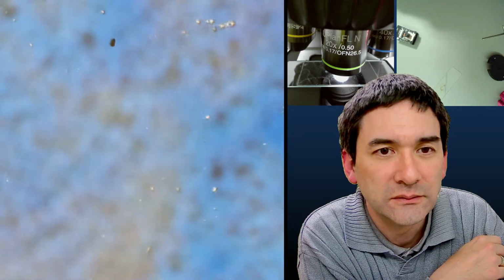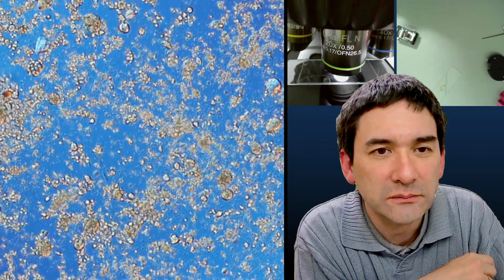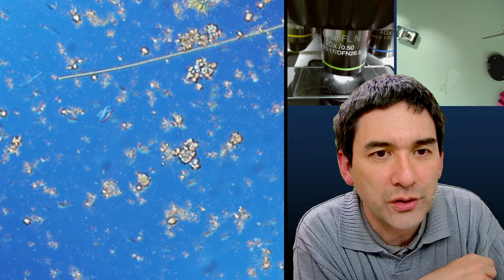Let me see if there's still something in here. You have to refocus. They moved all somewhere to the side, maybe where there's more oxygen. Usually they accumulate somewhere in one corner. Let's see if, I don't know. Nope.